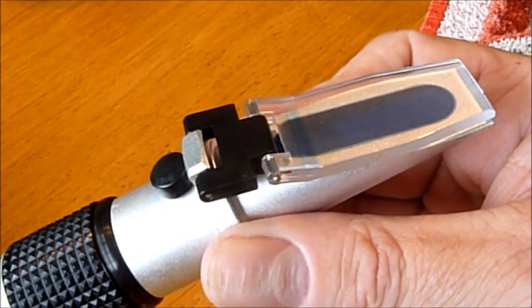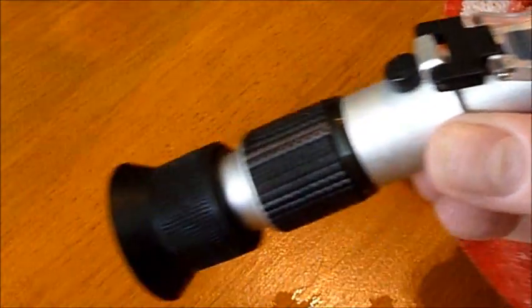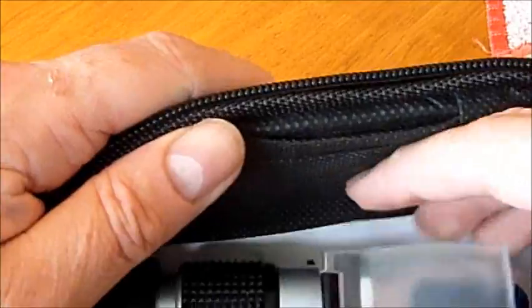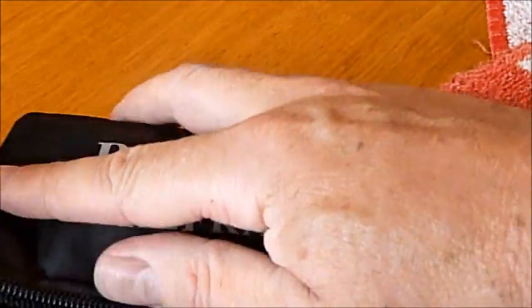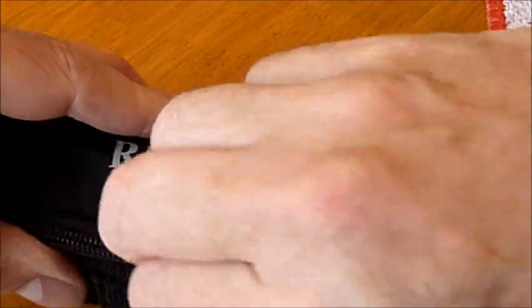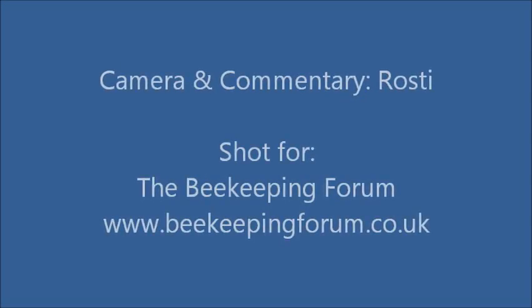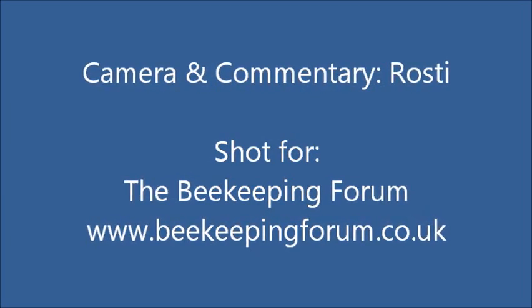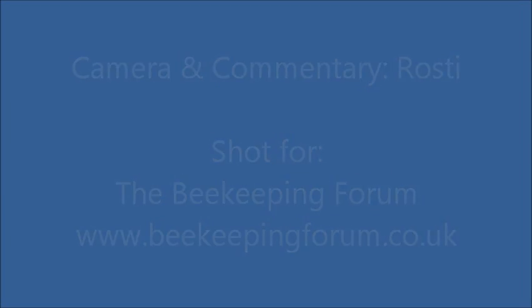That's clean, that's dry, we know it's calibrated. It goes back in the box, ready for hopefully another good honey harvest.